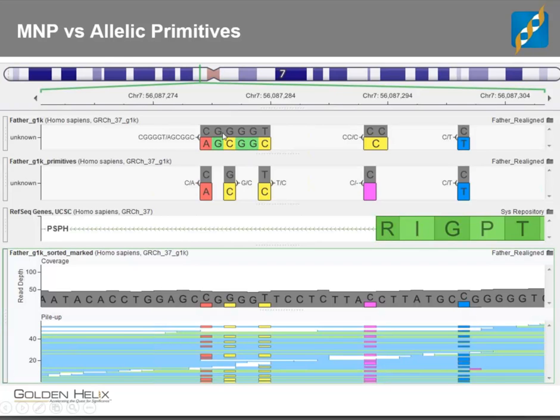As a haplotype, it's useful to treat this as one giant mutation because you can look at it in terms of these mutations all being on the same chromosome, hence they functionally are going to behave only on one chromosome. You're not having SNPs on both chromosomes. As individual SNPs, if you don't have phasing information, you don't know whether this is on one chromosome and this is on another. Yet at the same time, for annotation and for really utilizing any level of comparison between one file and another, we generally place data into its most primitive allelic form, such as this.